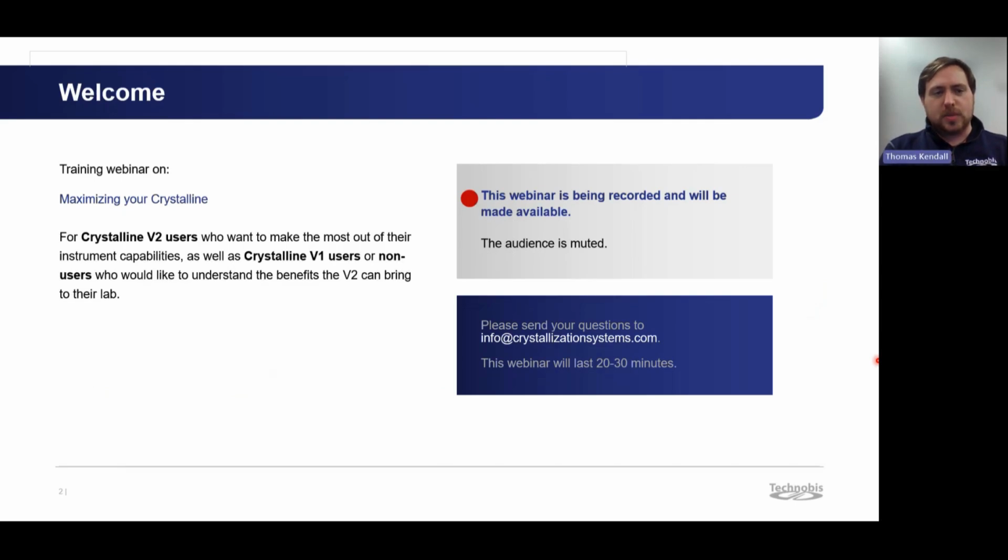This webinar is aimed at Crystalline version 2 users who want to make the most out of their instrument's capabilities, as well as any Crystalline version 1 users or non-users who want to understand the benefits the version 2 can bring to their research. This webinar is being recorded and will be made available to you after the session.